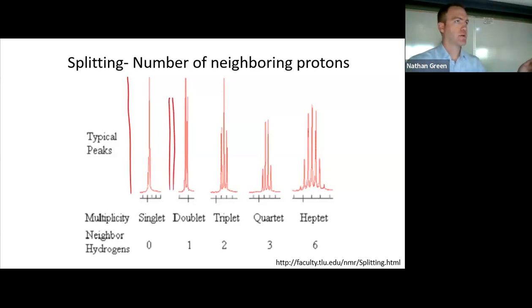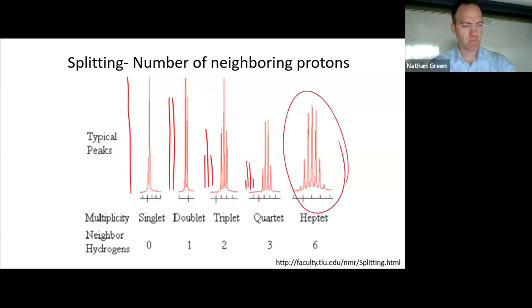So that would be like the Twin Towers when they were still standing, right? There can be structure to them, but you have 2 signals that show up roughly the same height. A triplet, I think, kind of looks like a psi. If you're into Teenage Mutant Ninja Turtles, that would be a short peak, tall peak, short peak. Again, there's some structure in each one of these, but you see the short, tall, short. A quartet is a short, tall, tall, short. Anything more than a quartet, we're going to just call a multiplet.